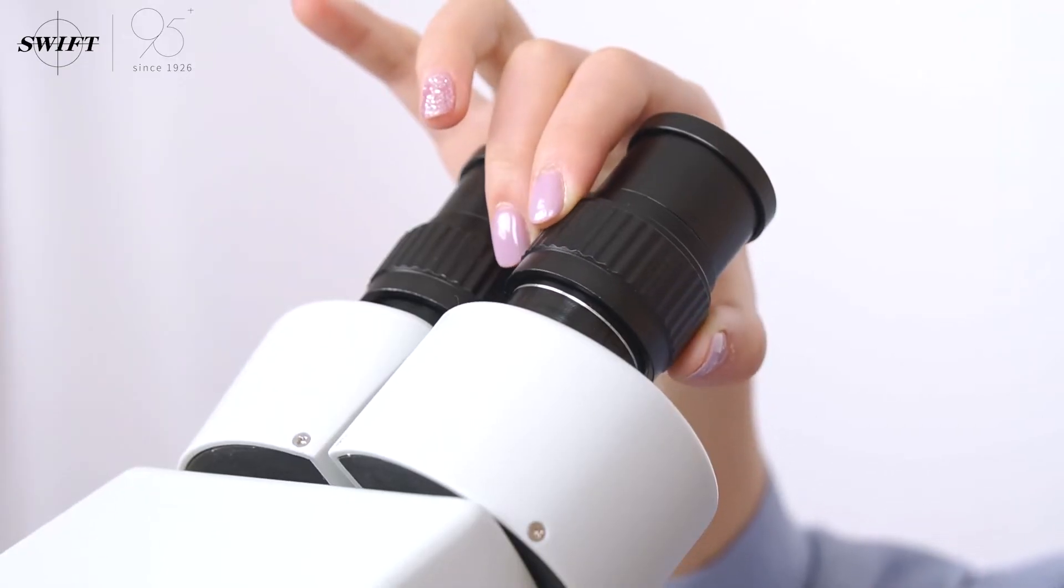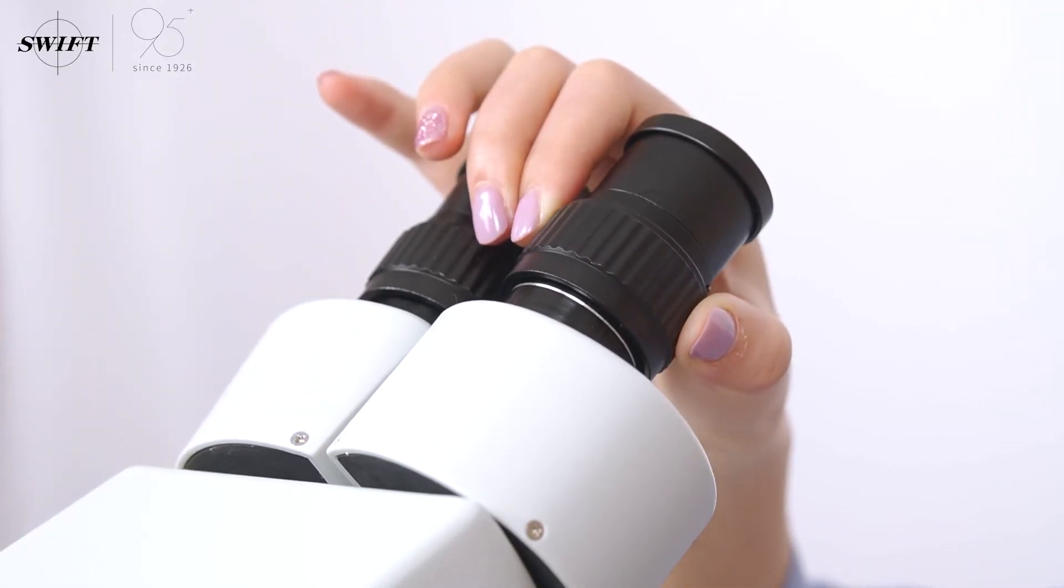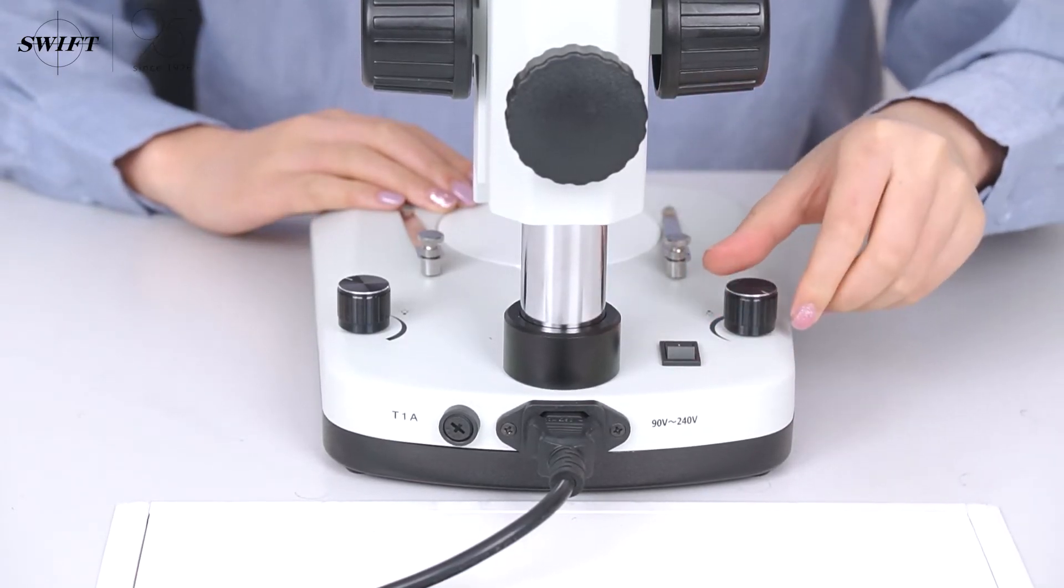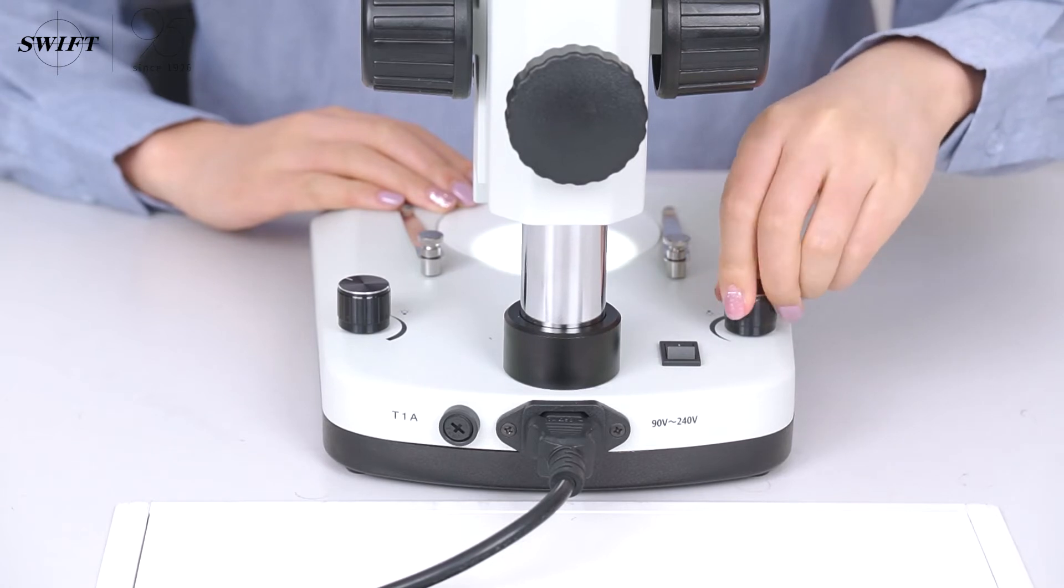When operating the microscope, first adjust the interpupillary distance to the position suitable for your eyes. Place the diopter circle at the starting position marked by the reticle. At this point, you can turn on the power and adjust the light source to a brightness that is comfortable for human eyes.